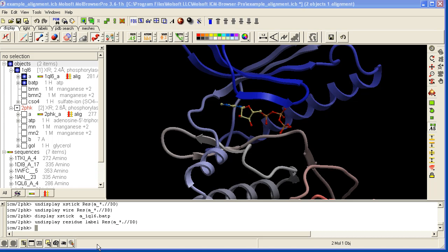How to use the ICM workspace. The ICM workspace is located on the left hand side of the graphical user interface.